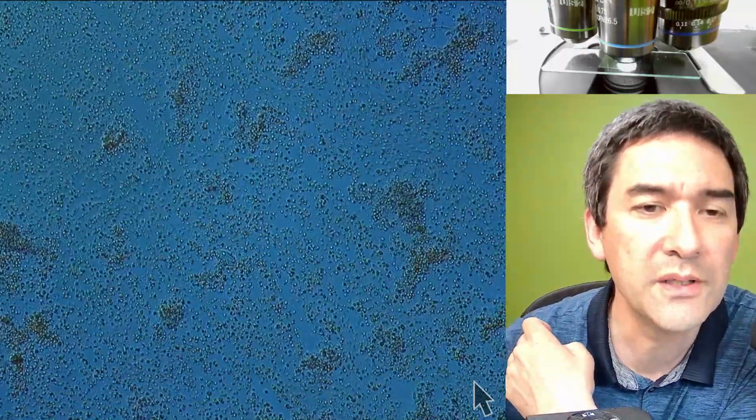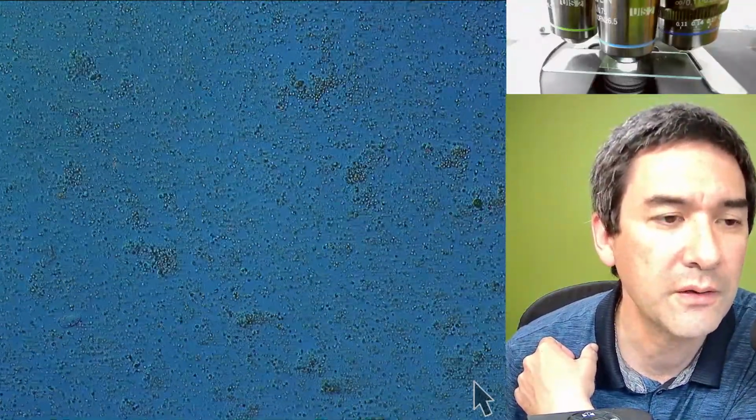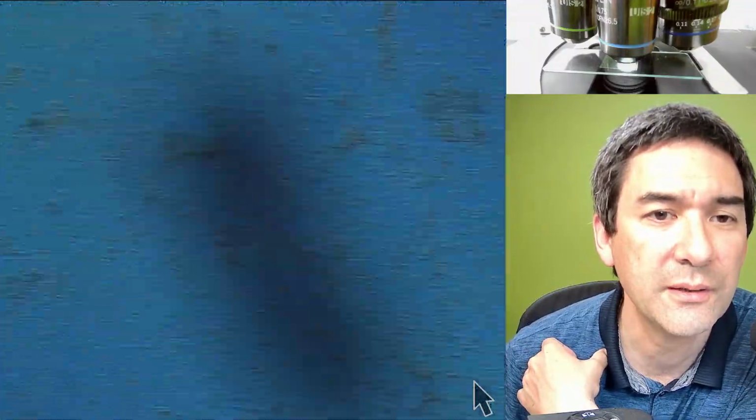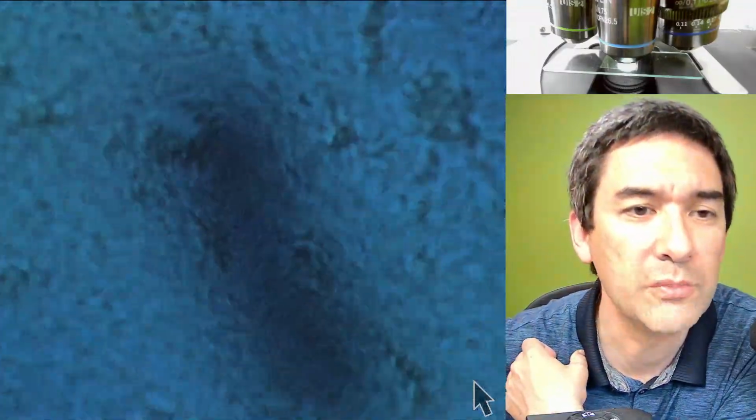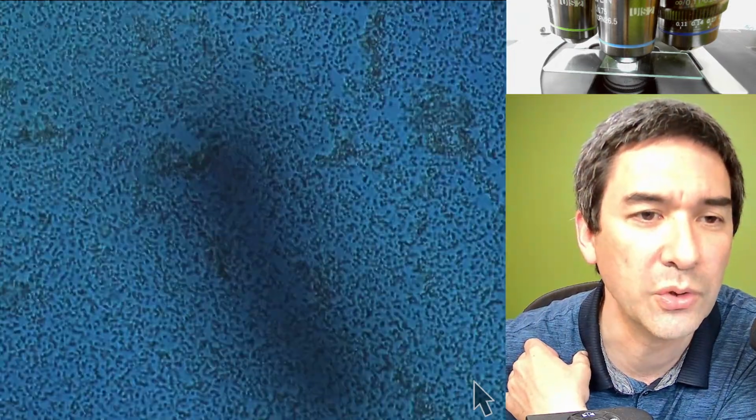Yeah, here, this must have been some kind of a fast-moving ciliate. Here it is. This guy's really fast. Maybe this one here right now in the center. Yes, that was it. What is this dark spot? Seems to be some kind of, I don't know, some dirt.